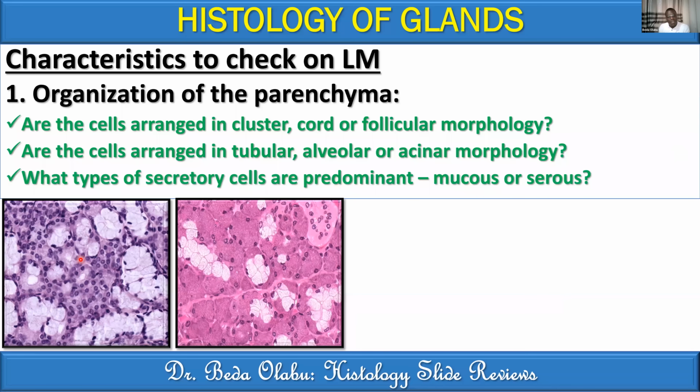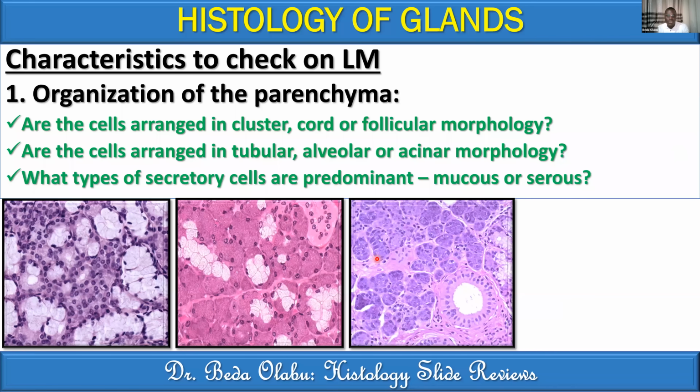This other one, maybe 40-60 or perhaps 30-70 with the serous one taking the lion's share, but it's still seromucus. A classical serous pattern is the one shown on the third image there. Most of these are staining. You're only seeing a small part that's not staining, less than 10%. So this is definitely predominantly serous.